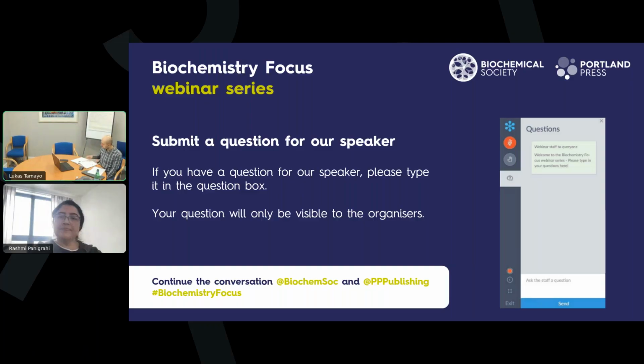So there is already one question about NMR. I am not an expert in nuclear magnetic resonance, and the question asked is, why do you think that when you search for unique NCP stacks, none of those 660 plus PDB structures were obtained with NMR?